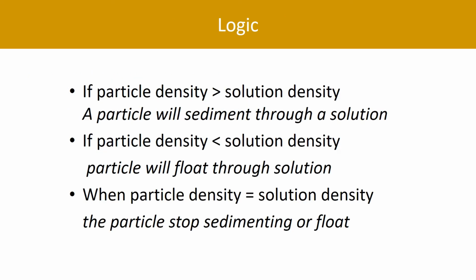Though we have seen the logic of density gradient centrifugation earlier, let us look at it once more. The basic logic of this technique is, if the particle density is greater than the solution density, you know that the particle will sediment through the solution. As simple as you drop a stone in water. What will happen to the stone? The stone will sink.